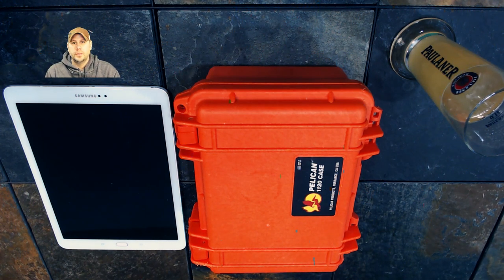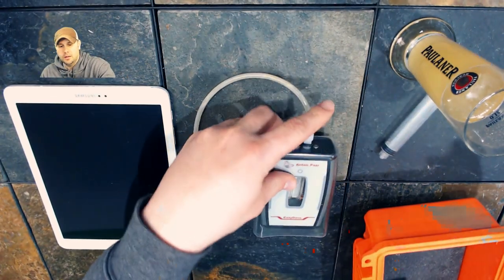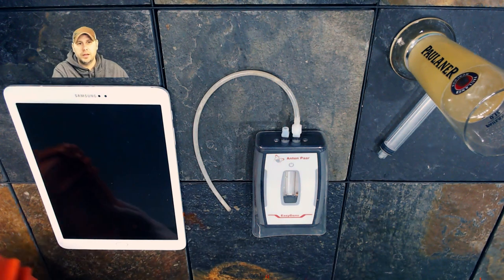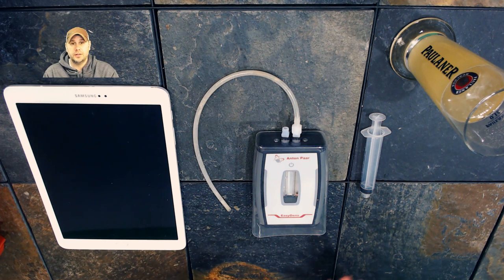So here we are — what is the Anton Paar EasyDens? Well, the Anton Paar EasyDens is a small handheld density meter that can take gravity readings hot, cold, mashing, boiling, finished beer, and carbonated beer — asterisk, we have to decarbonate the sample, but that's super easy and I'll show you how I do that. This little handheld device I find is an invaluable tool in my brewery.